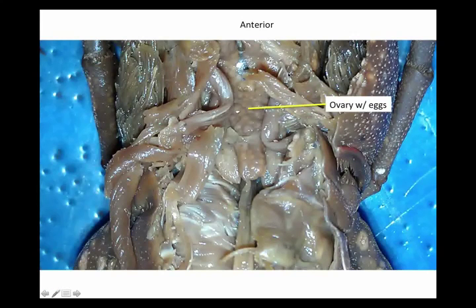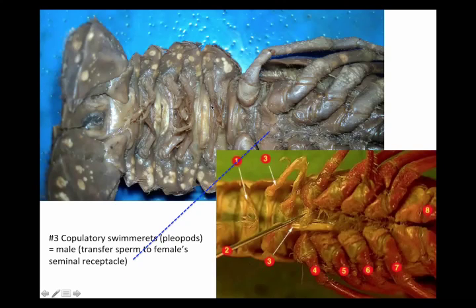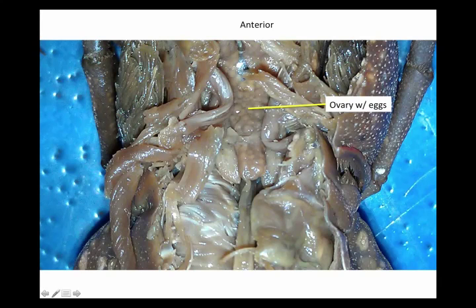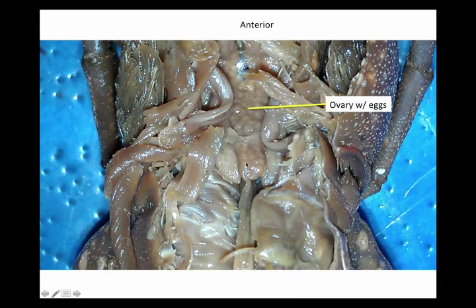This is a female crayfish that actually has eggs in her ovaries. Here's the abdomen and here are the gills, and the cephalothorax is up here. You can see her ovary and uterus — all the reproductive parts — and her eggs inside. That's pretty neat to be able to see that.